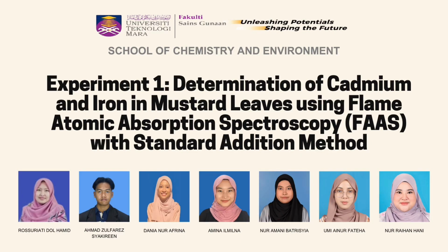Assalamualaikum and hi. This experiment will demonstrate the use of atomic absorption spectroscopy as a tool to determine the concentration of iron and cadmium in mustard leaf, where the data of this instrument will be quantified by standard addition method, and this video was prepared by our team.